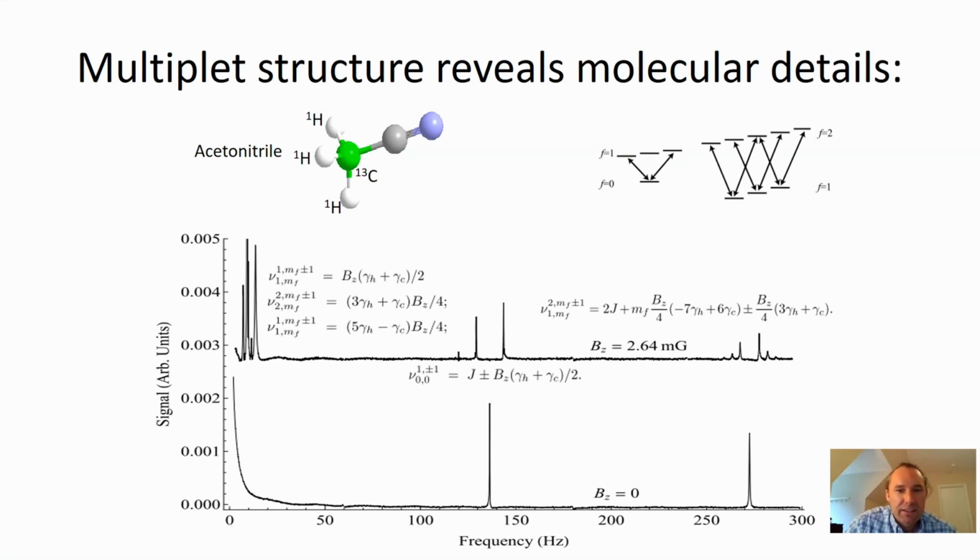Thomas, here's an interesting question from Ilya. Is quadrature detection possible here? Simulations seem to show that some frequencies here are positive and others are negative and reflected back. Yeah, this is correct. Ilya and us have been working together very closely, and what I'm going to show next are the simulations as a result of working together with Ilya, where we show that the Spinach package reflects exactly how this is done without quadrature detection.